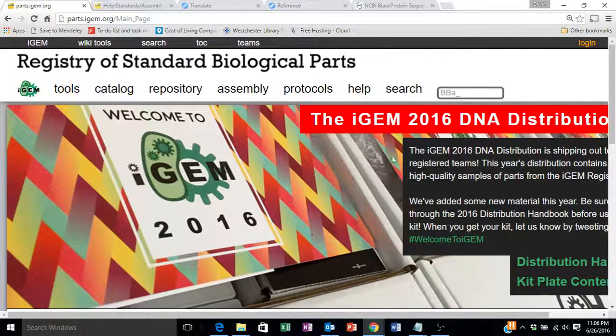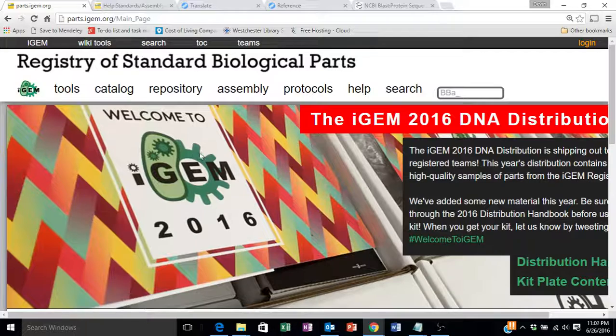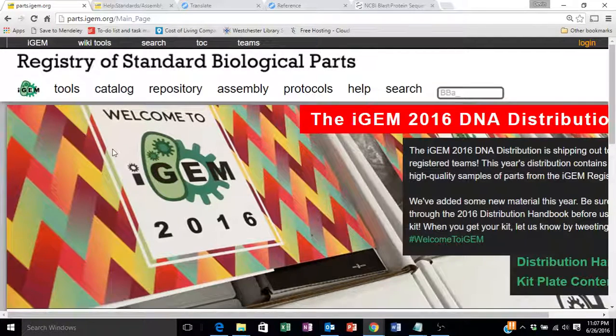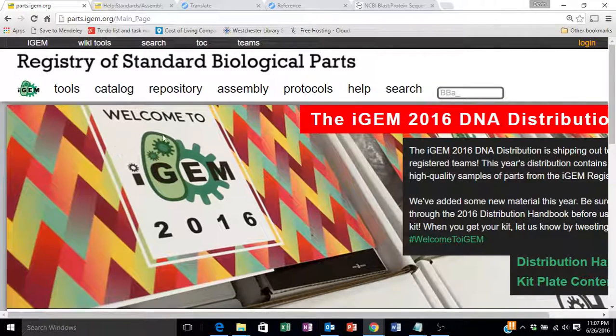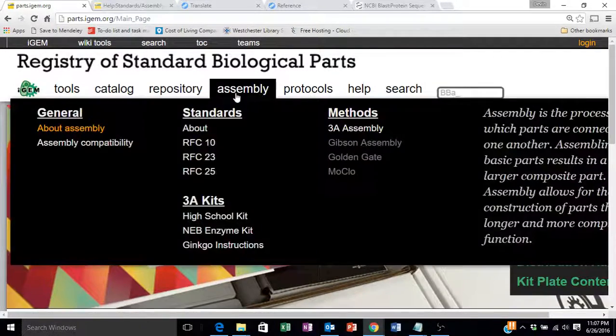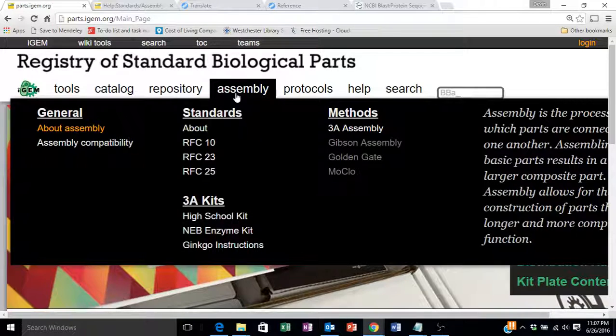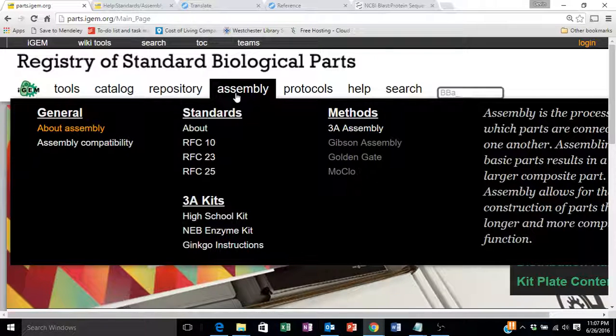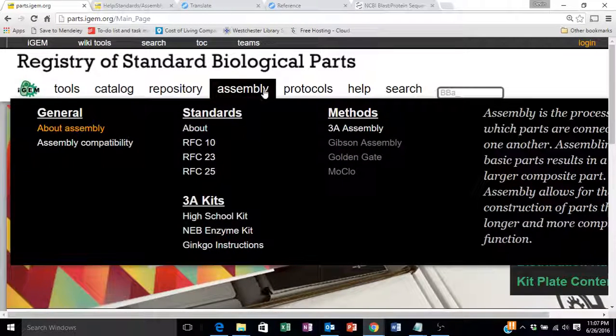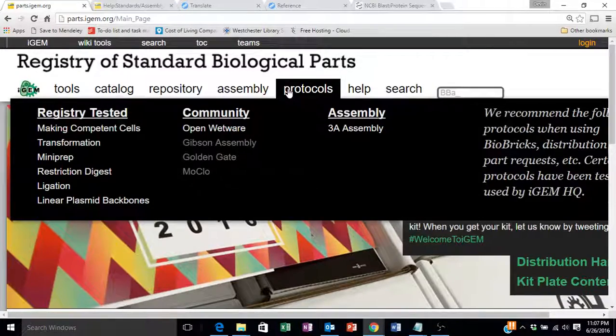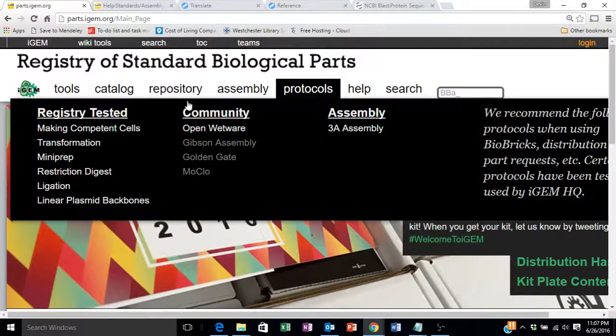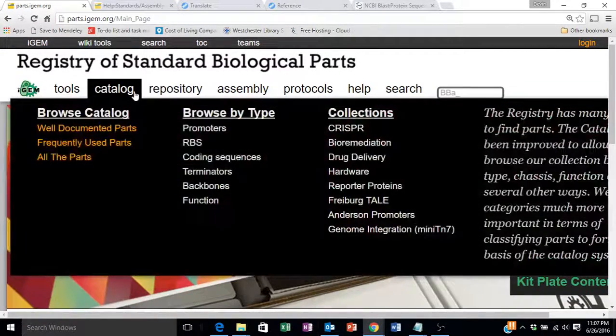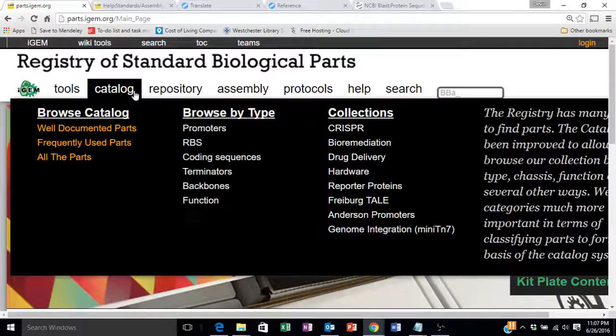This website contains a ton of information both on how the parts can be assembled with other parts, the protocols that can be used to do this, as well as different collections and a catalog of parts.